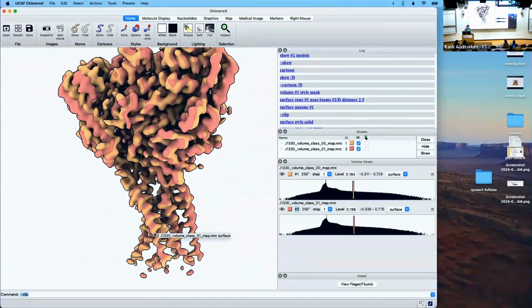I think that if we wanted, we could make a mask locally refined focused on the TMD. There's so much more mass up here that basically we're aligning the top and letting the legs swing back and forth.